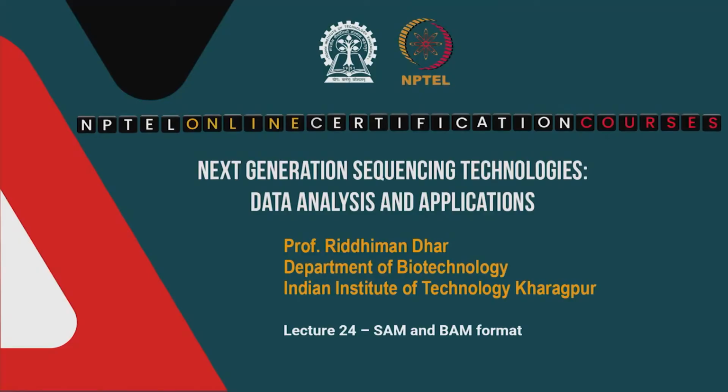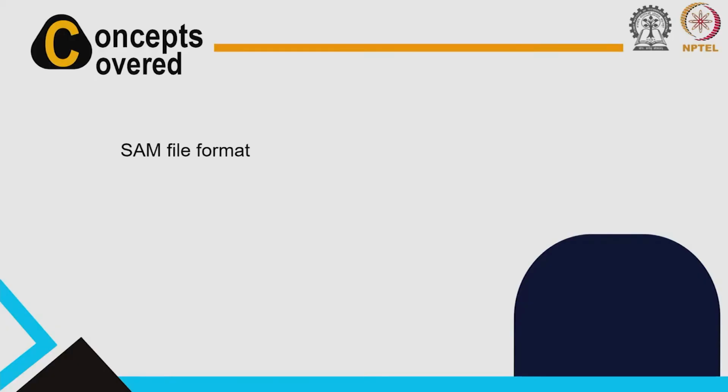Good day everyone, welcome to the course on next generation sequencing technology, data analysis and applications. In the last class we started looking at the SAM file format and described the header section, so we have seen what kind of information you have in the header section. In this class we will go deeper and look at the alignment section, where we have the most interesting results, where the mapping results are reported. That is something which we will cover in this class on SAM file format.